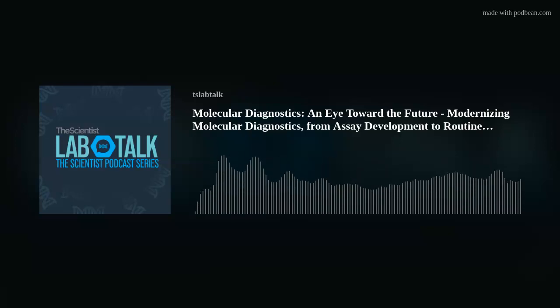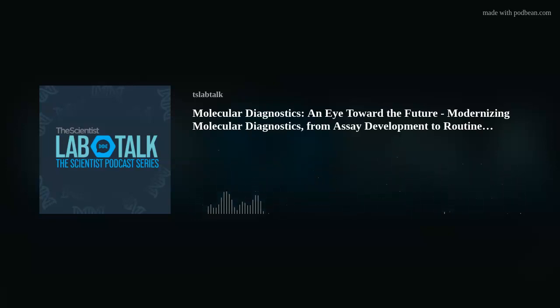These tests generate large amounts of data. So what are some specific needs that research teams have for collecting and storing molecular diagnostics data and connecting the instruments to their LIS, Laboratory Information System? Do they have specific concerns related to data security?